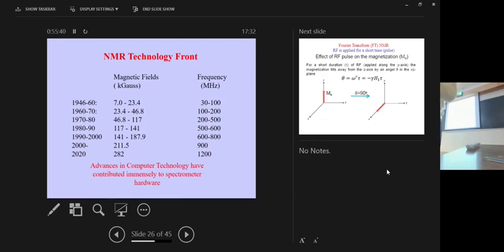And you have to keep filling helium to keep the material in the superconducting state. So therefore, it is the persistent current, therefore the persistent field. And that also has reduced the size of the spectrometers, the size of the magnets, and that is an enormously great technological development, but cost-wise, it is extremely prohibitive.